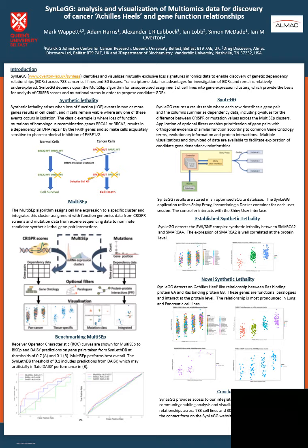The cornerstone of this is transcriptomics data for investigation of these gene dependency relationships, and we've integrated this with functional genomics data from large CRISPR screens and exome sequencing data to establish mutational status in order to propose these candidate gene dependency relationships.